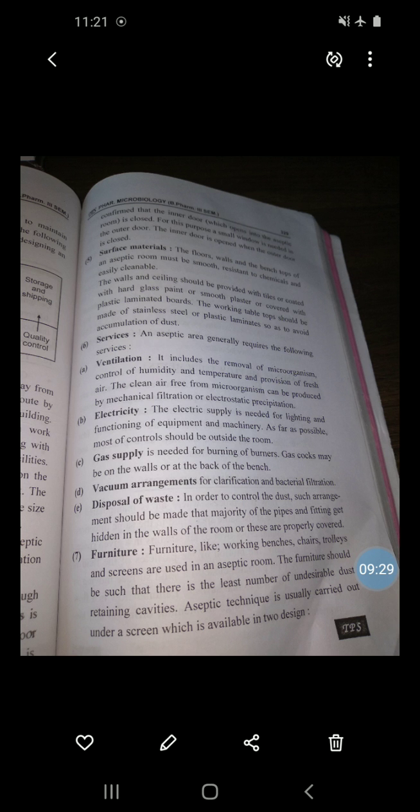As far as possible, most of the controls should be outside the room. It means the main switch of electricity should be outside the room in order to avoid any difficulty. Then gas supply. Gas supply is needed for burning of burners.